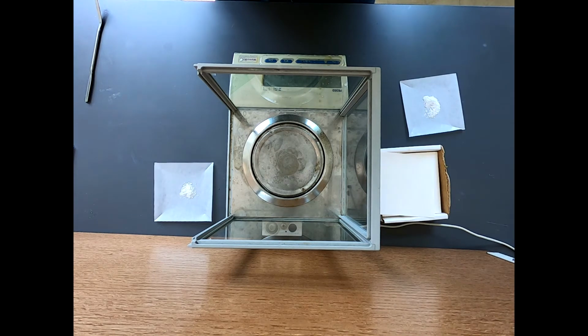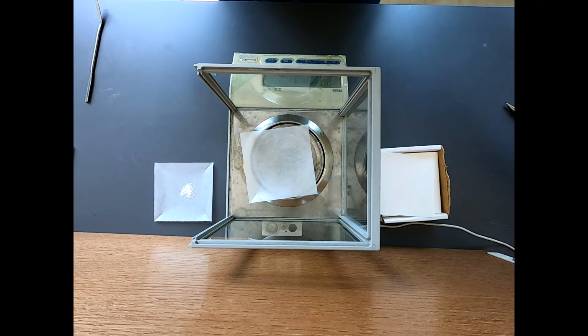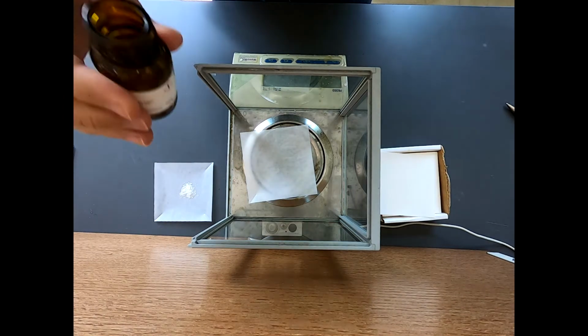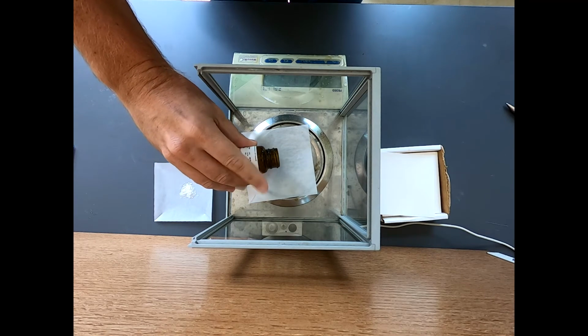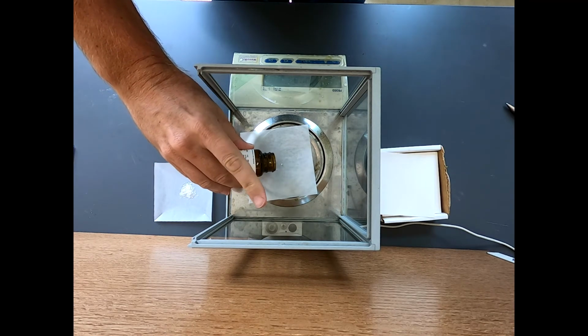And let's get now another weighing paper. So I've gone just a touch over 1 millimole of the cycloadduct, and I want about 1 millimole of the hydrazide. So this is the hydrazide, and I know 1 millimole is 204.15 milligrams. So let's see what we can do here. If I go a touch over, that's okay.